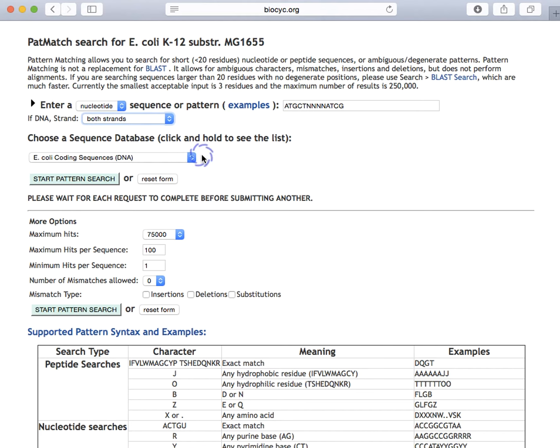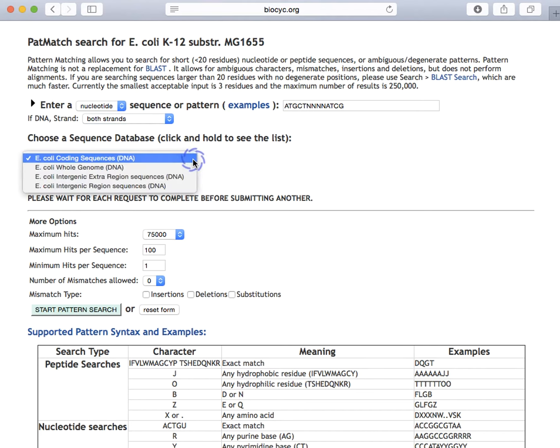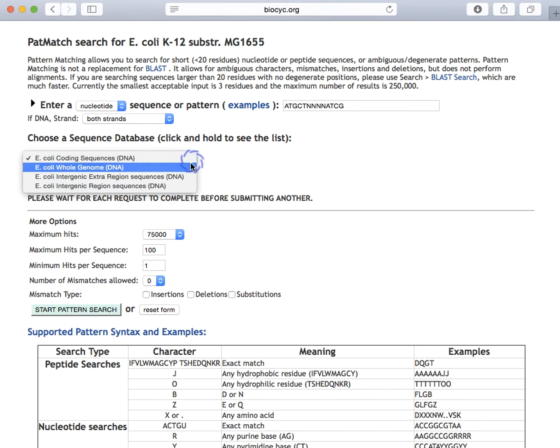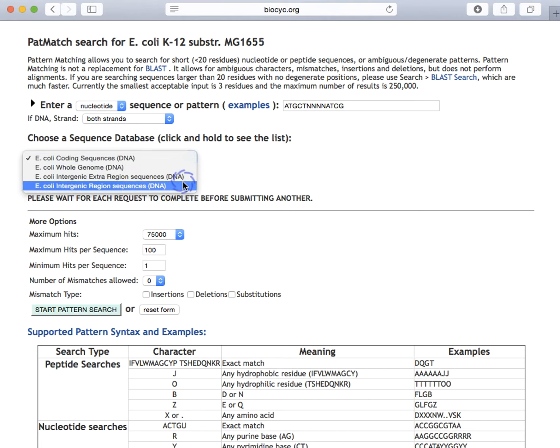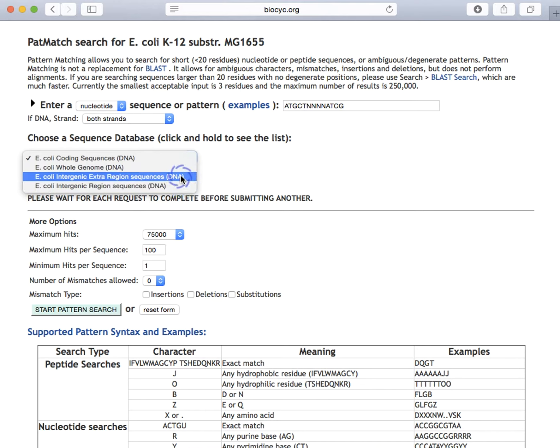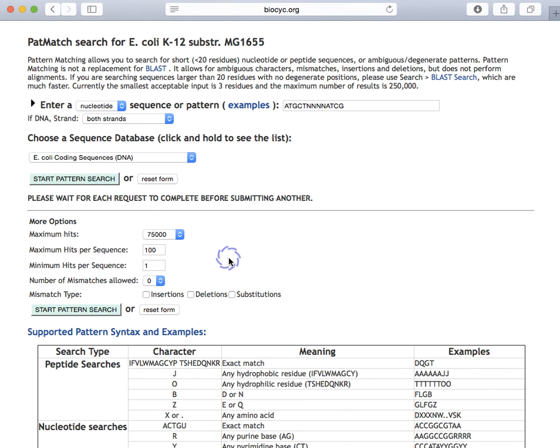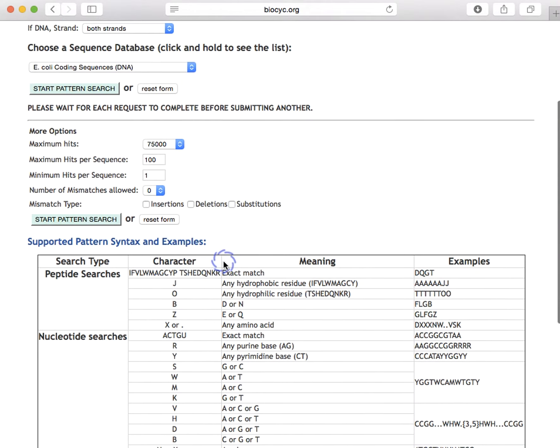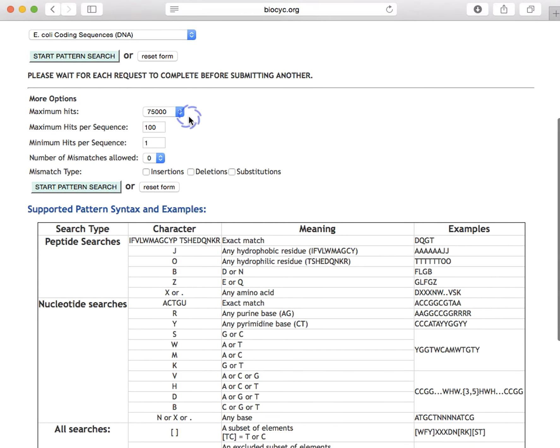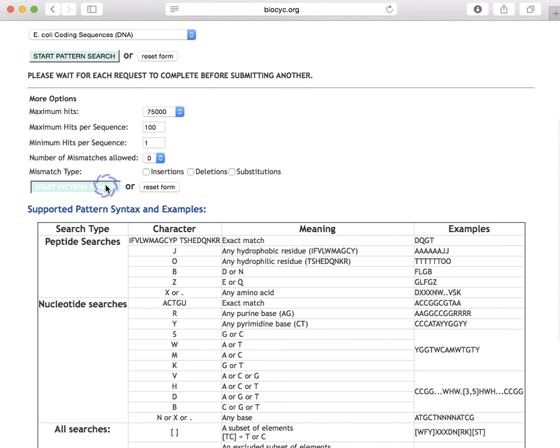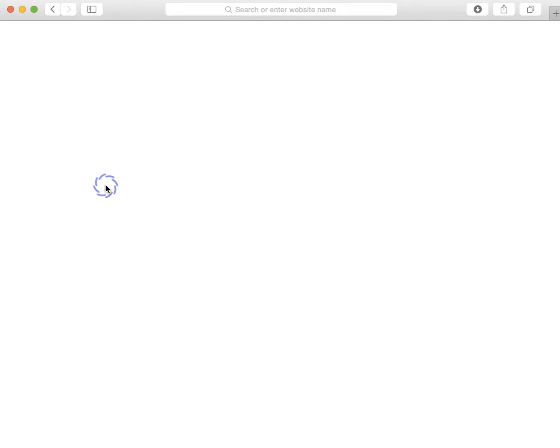And then we can search against either both strands or only one strand, and we can also determine whether we search against the entire set of DNA coding sequences for all genes, against the whole genome, against just the intergenic regions, or against the intergenic regions plus additional flanking sequences on each side. Then there are additional search options right here to limit the number of searches. Let's run our search.